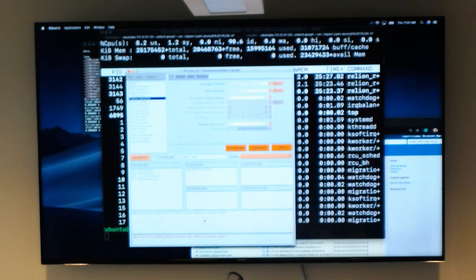Waiting for skills. Theoretically, this is not going to be incredible.